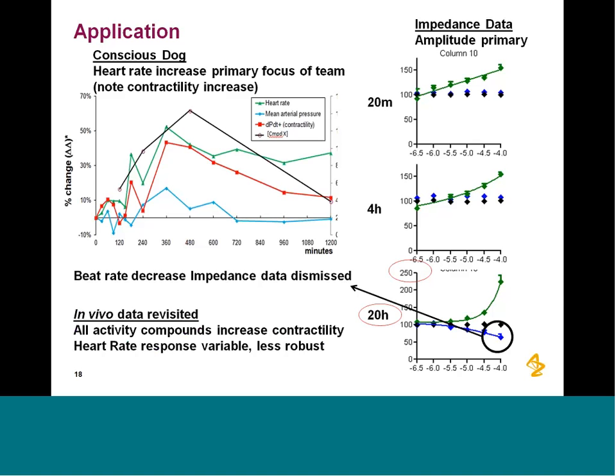It has quite a bit. And whether it be guinea pig, well, in guinea pig, sure enough, contractility was more of a robust change than heart rate. And if you look at the dog data, as you go down in dose, you lose heart rate effects, and you still maintain contractility effects in the absence of a heart rate.